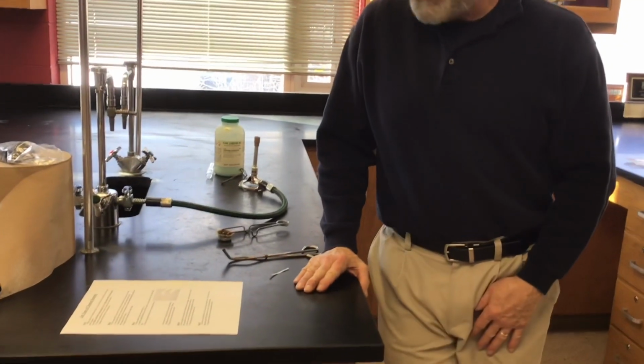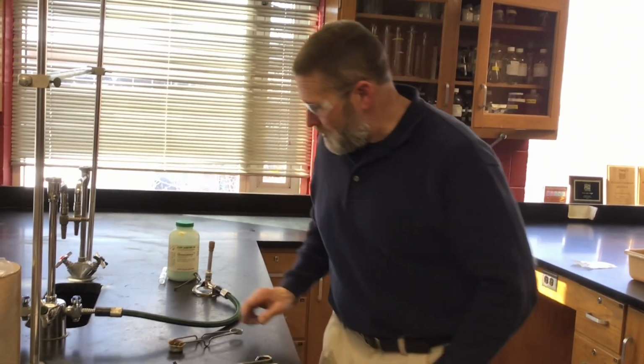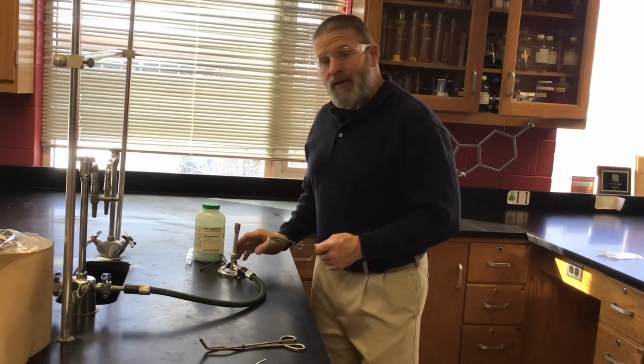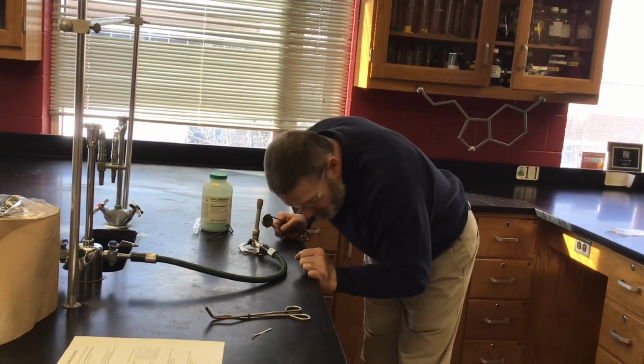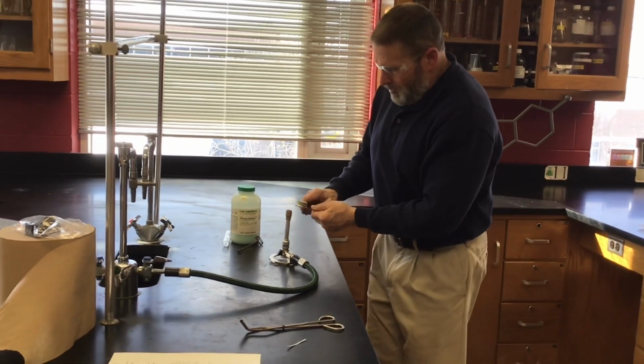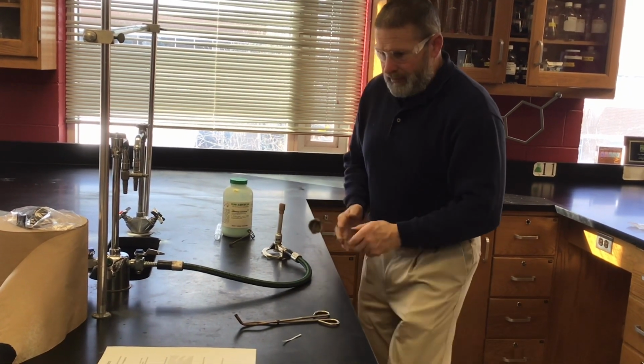Okay, here is step 1 of reaction 1, which is burning magnesium. Step 1 is to burn magnesium metal. This may look familiar to you, but we'll run it again just because it's fun. We wouldn't miss out on the chance to burn magnesium a second time. You guys are missing out on all the fun of lighting a Bunsen burner.